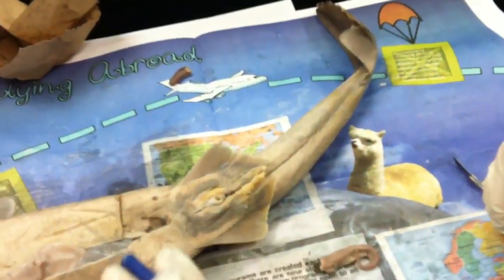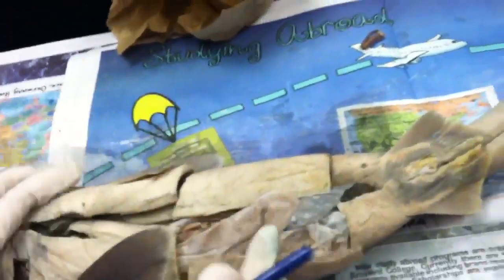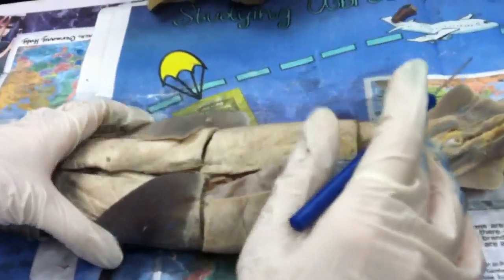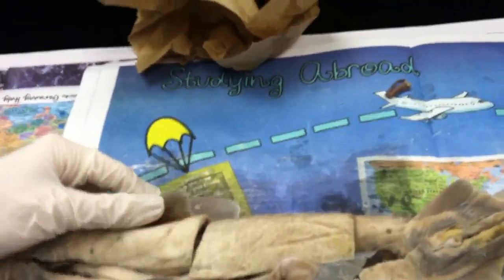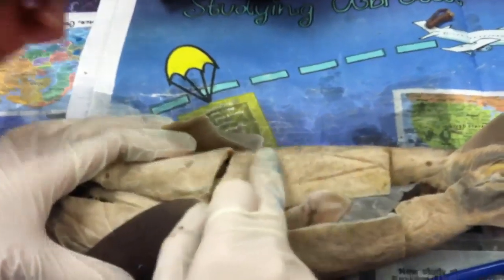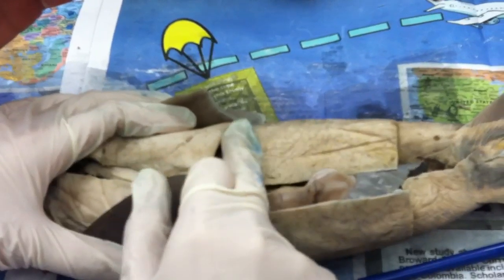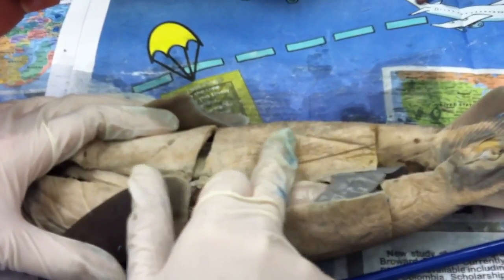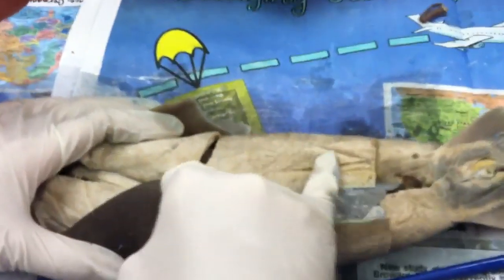Placoid scales — these scales are on the skin. When you put your finger one way, it's smooth, and when you pull back the other way, it catches your finger. So you know there are scales.